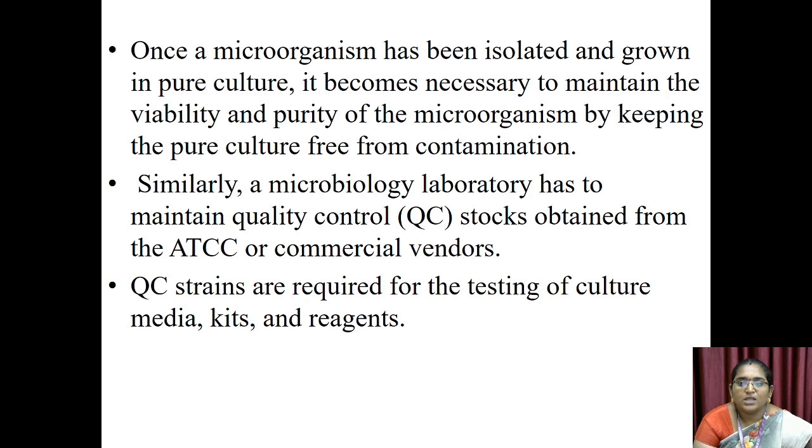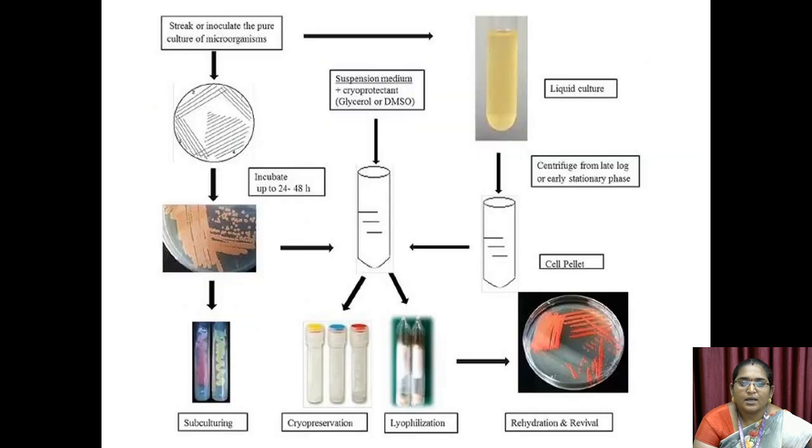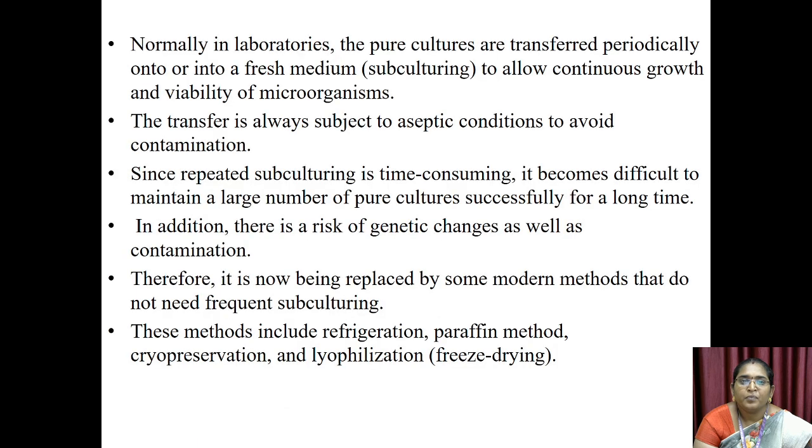Similarly, a microbiology laboratory has to maintain quality control stocks obtained from the ATCC or commercial vendors. ATCC stands for American Type Culture Collection. QC strains are required for the testing of culture media, kits and reagents. This is the overview of preservation and maintenance of microorganisms.